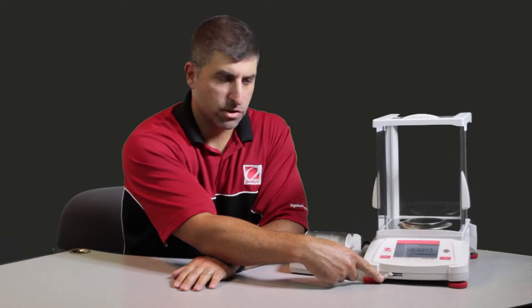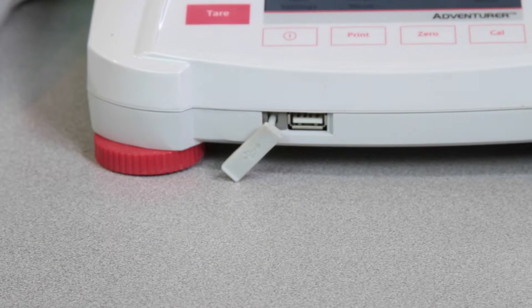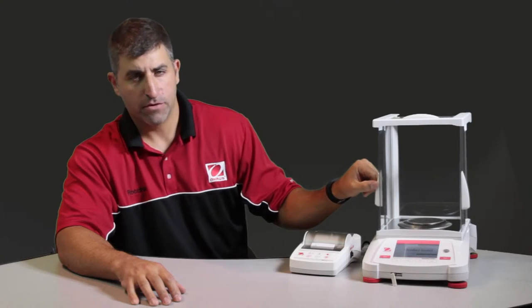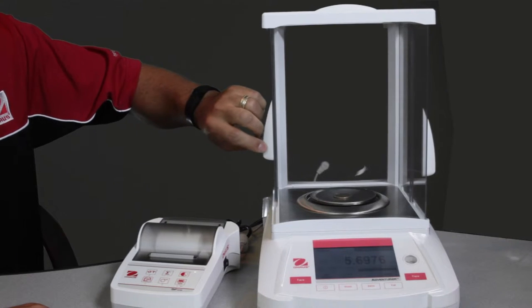The Adventurer AX has a new USB port in the front for cloning or recording data. The draft shield on the AX has dual sliding doors so you don't need as much room behind the balance.